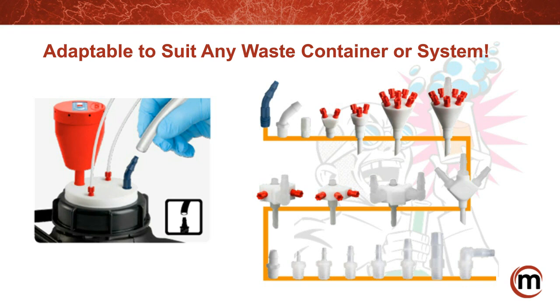Okay. And another question, how quickly can you fill the large waste container without much back pressure? How quickly can you fill it? Yeah, you can fill it as quick as you want.